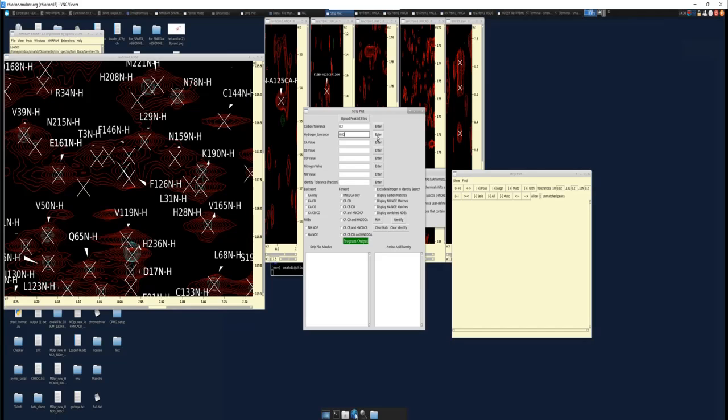If you have a smaller range of deviations for carbon or hydrogen, you're more likely to get the exact match that you're searching for. If you have a wider range, you're going to get more matches. I find 0.2 and 0.02 are pretty reasonable ranges. If your carbon value deviates by more than 0.2, it's probably not the same carbon that you're searching for here.